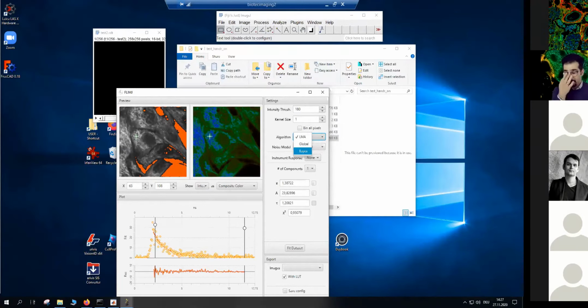So we have seen it several times. So maybe I can say that what that stands for is Levenberg-Marquardt algorithm. So quite difficult names, but this is the one which I think most of the software is using for this iterative fitting that we need to do to find the data. And in the noise model, we talk about them. So we go for the MLE as before.